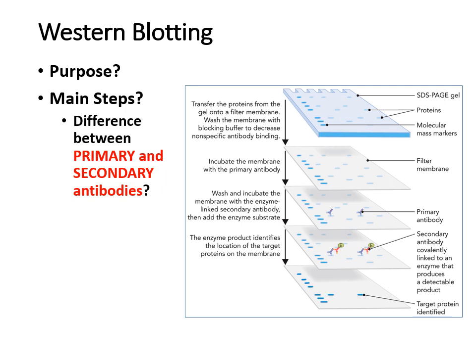Then we get to Western blotting. Even though the textbook puts it at this point in the lecture, you actually have this connected to gel electrophoresis. Western blotting is something that's very valuable in all of the different classes in the sciences that you take and all the different research that you can do. The purpose of Western blotting is to identify proteins that have been separated by the SDS PAGE gels that we mentioned earlier in this lecture.